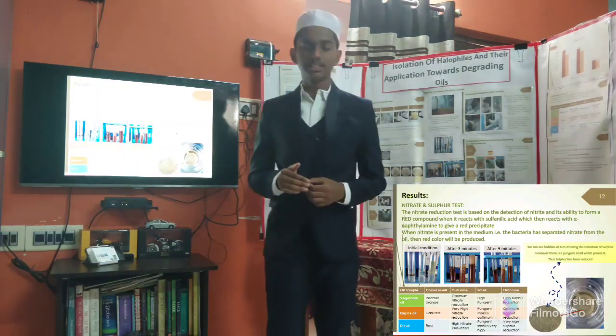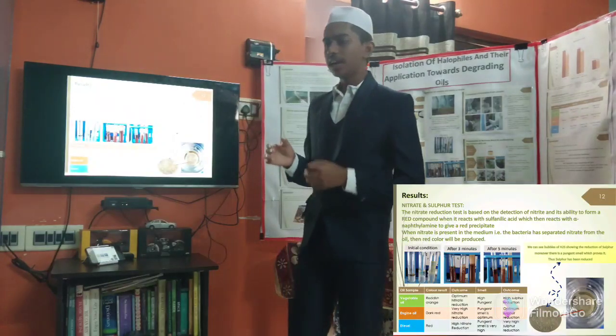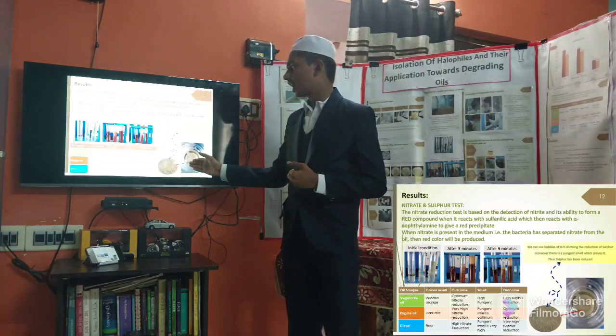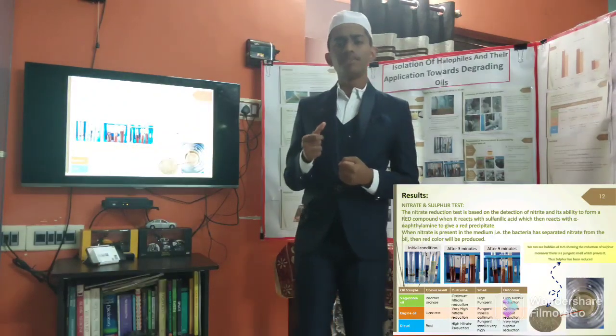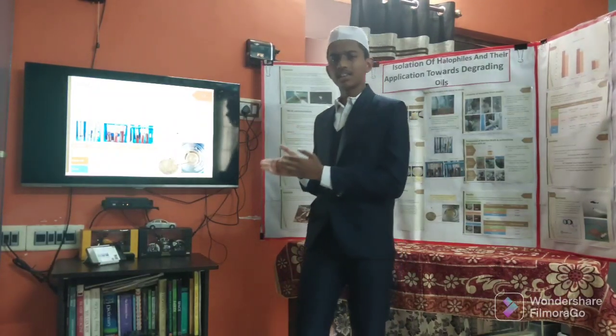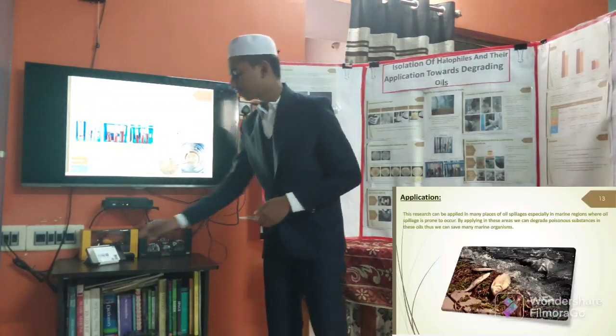And then we tested the sulfur. We know that sulfur produces a pungent smell. We can see the bubbles of H2S gas too, and when we opened it, we found a pungent smell. From this, we can say that the bacteria has degraded hazardous oil contents like nitrate and sulfur.